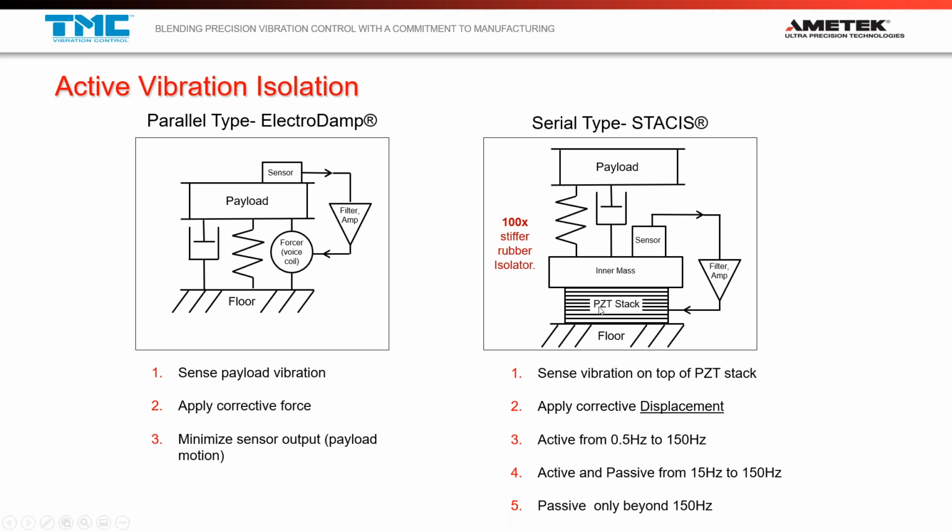So we've got this load-bearing stack, we've got this feedback control loop on the inner mass, and we have the passive component, which is then supporting the payload, which is, like I said before, usually a platform supporting your microscope. And what's the key difference between these two systems?